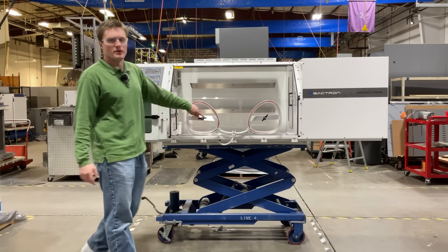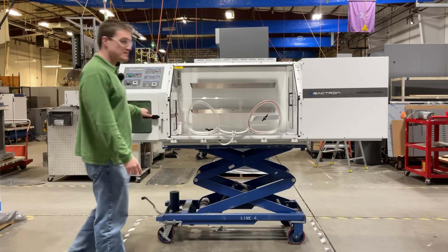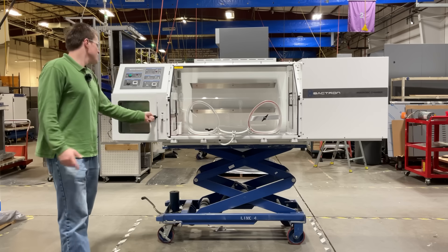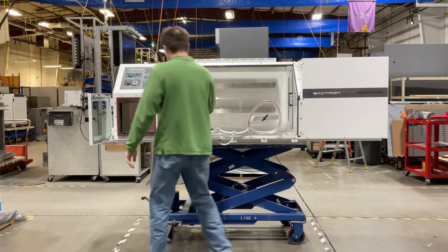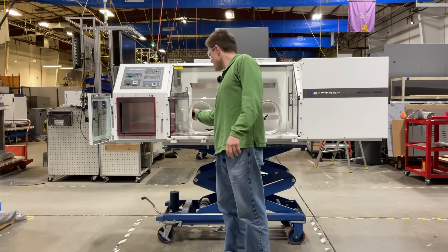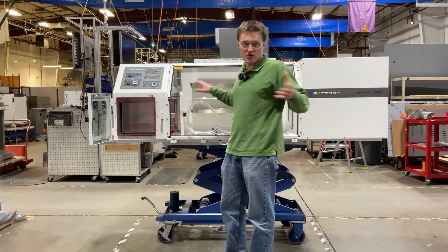Now let's take a look inside the unit. The first thing that you'll notice is the spacious vacuum pass box. This features a sliding drawer to allow you to introduce large amounts of samples or any devices you want to have inside your chamber without disrupting the environment.